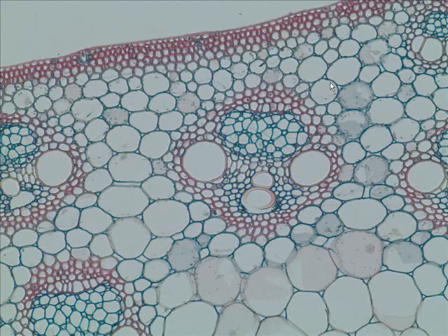All right, let's move into a vascular bundle then. And here's a vascular bundle. Here's the epidermis around the outside. Here's this red stuff, sclerenchyma. One more time, what's this? Parenchyma. What's the position name for it? Ground tissue. Okay, here's a vascular bundle. And what type of tissue is this surrounding the bundle? It is called sclerenchyma.